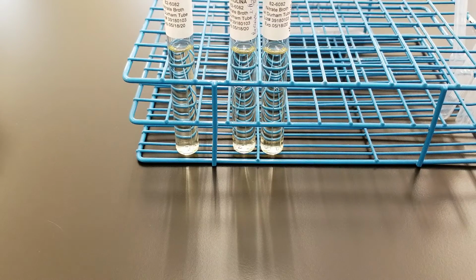So although this grouping of organisms that we have at the beginning of the lab class does not include the gram-negative rods, like the Enterobacteriaceae and the non-fermenters and the rest of Moraxella, we're just going to focus on this, and this process can be applied to either one of those groupings, okay? It's just the test itself.